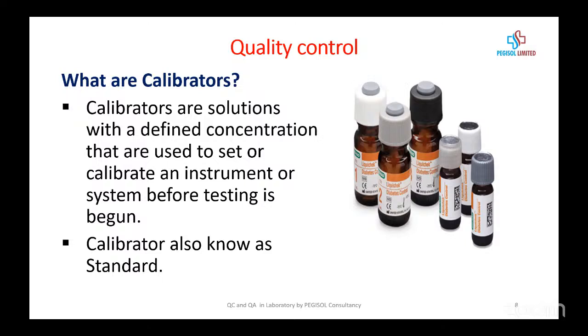That is the only way you can see it. So calibrators help to adjust the set point of an equipment, or a test method, for it to read at a particular level or a particular frequency. Am I communicating? Yeah.